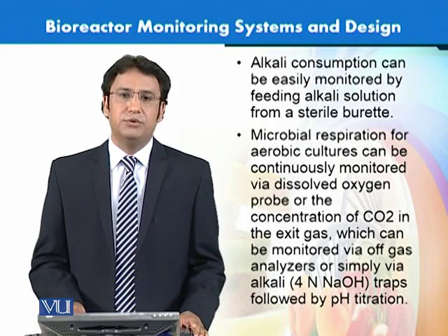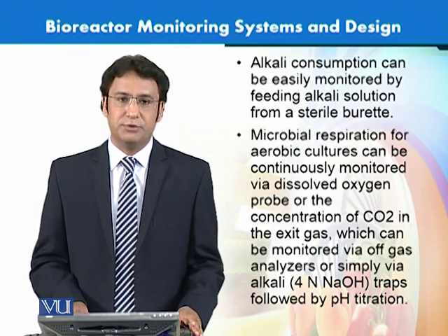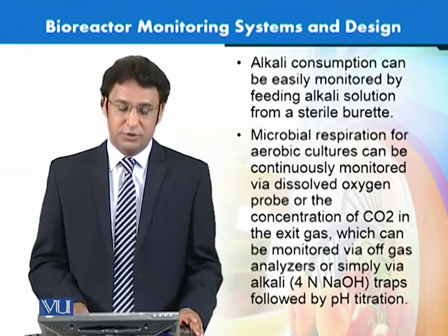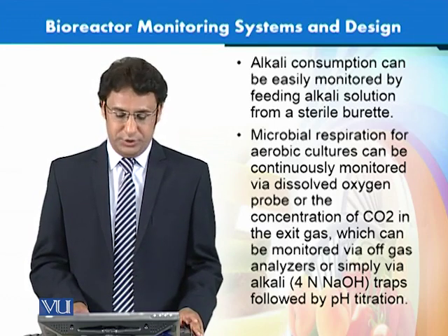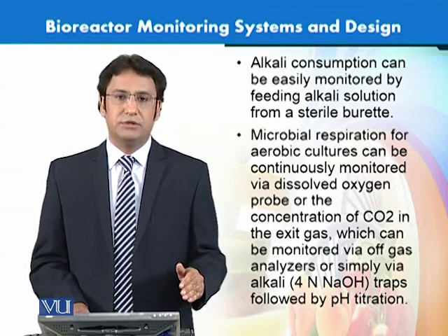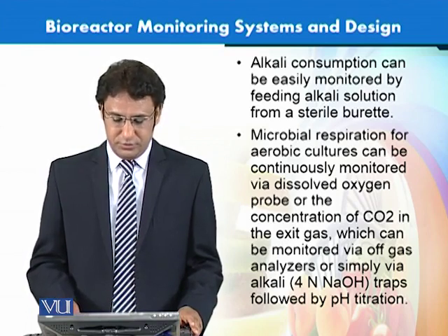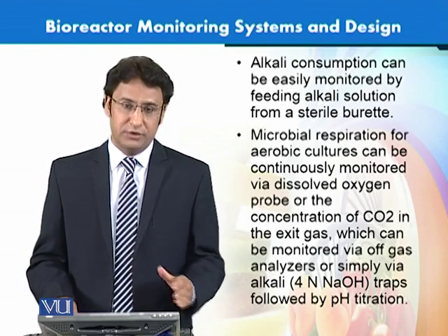Another thing that we want to monitor in these bioreactors could be microbial respiration, and it would depend again on whether we are talking about aerobic cultures or anaerobic cultures. If you are talking about aerobic cultures, maybe we can monitor the dissolved oxygen level through probes, or we can also measure the carbon dioxide in the exit gases. That information would tell us about the respiration rate of these microorganisms. So that can give us good information about the growth mechanism or the growth rate of these organisms.